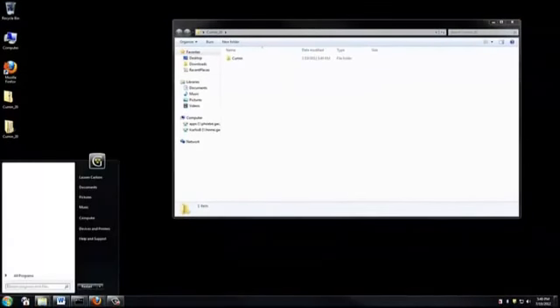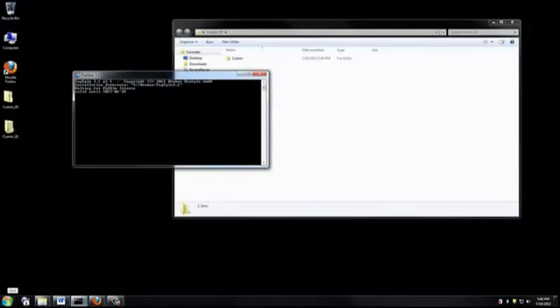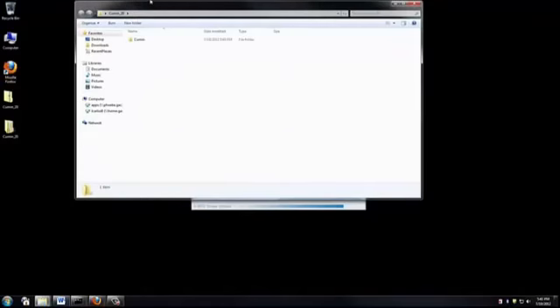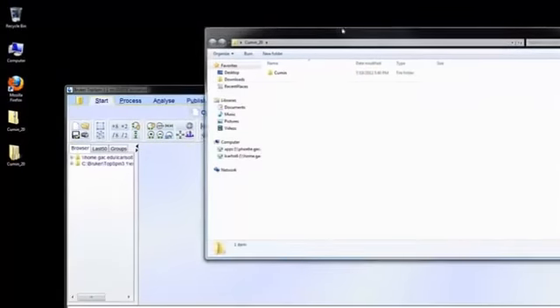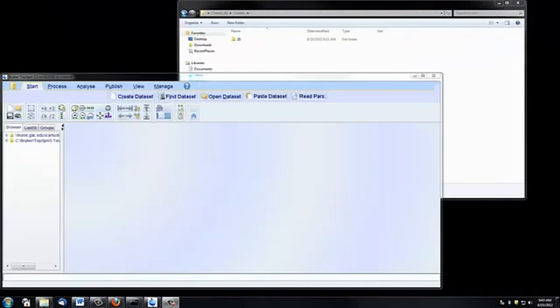The next thing we need to do is open TopSpin, so I'm going to search for it in the search bar. Open the application. Okay, so this is TopSpin. And the next thing I need to do is import the data into TopSpin. So if I double click on this title, which is cumin, I'll get to the actual experiment number. And I can actually just drag this file straight into TopSpin.